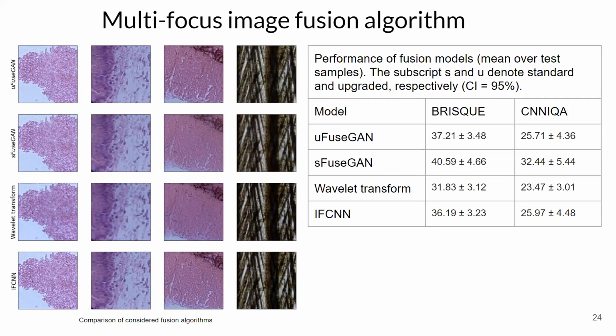The intuition behind that can be that the wavelet transform is a transform-based algorithm: it translates images to another domain, glues them together and reverses the transformation, and therefore the image turns out to be smooth with smooth transitions. On the contrary, the proposed methods like convolutional neural networks and the GAN-based model use a pixel-based approach, so they can still get non-smooth transitions that are invisible to the human eye, and the metrics can show that.